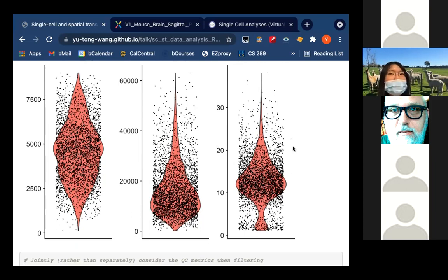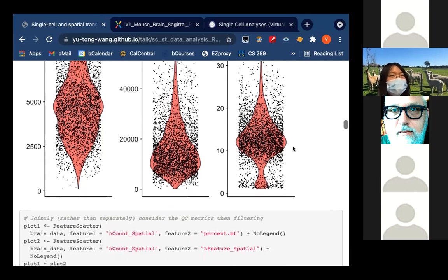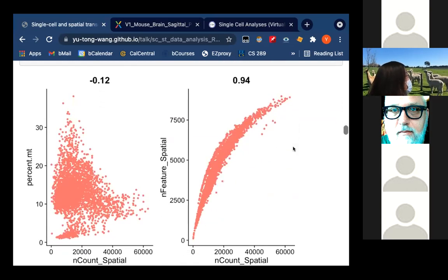So is it fair to say you're basically looking for where it thins out and where you empirically are seeing more outliers? Yes. Okay. So it's like going by eye for the outliers. Right. That's normally what I do.